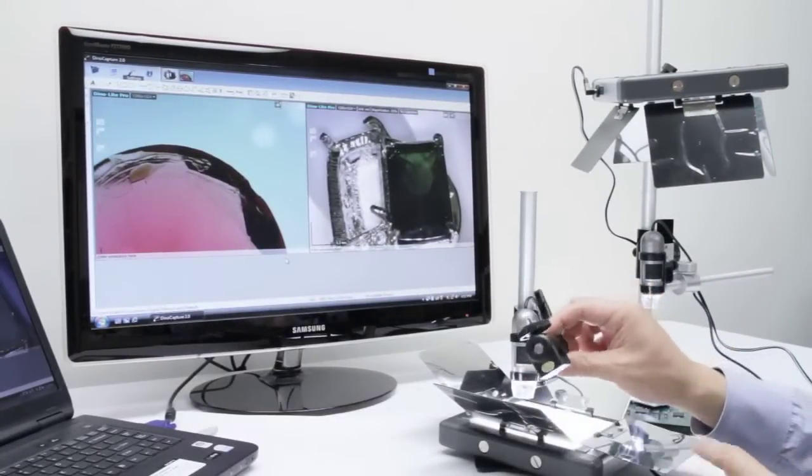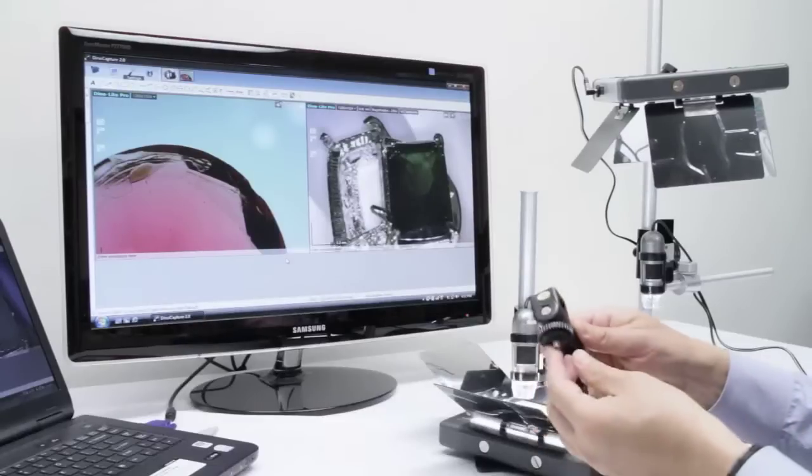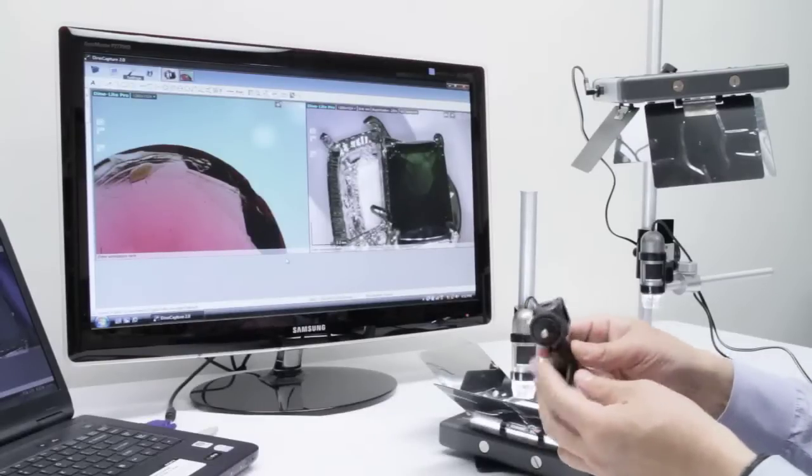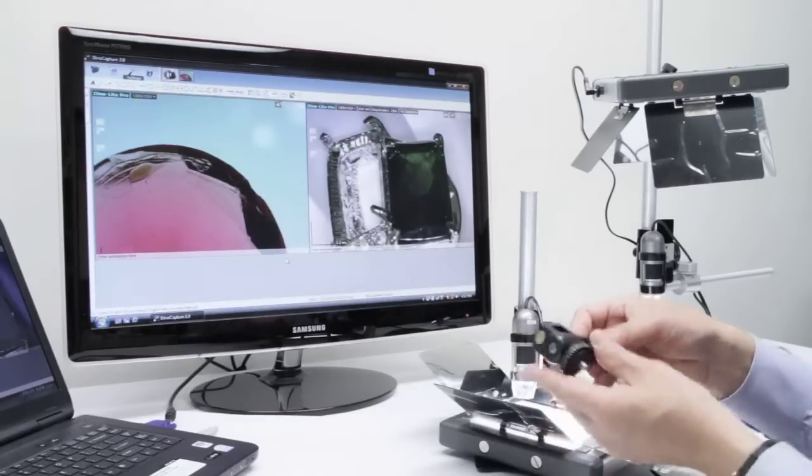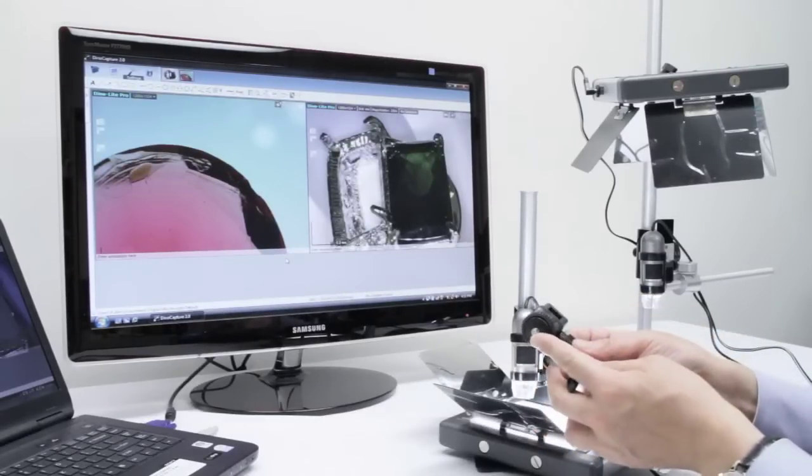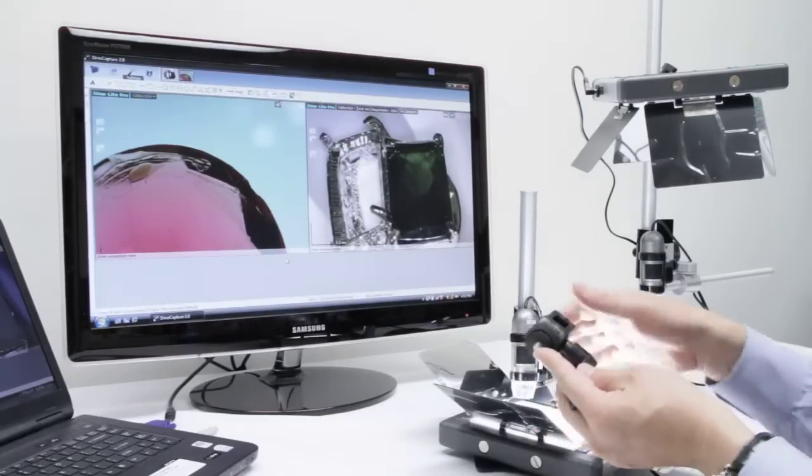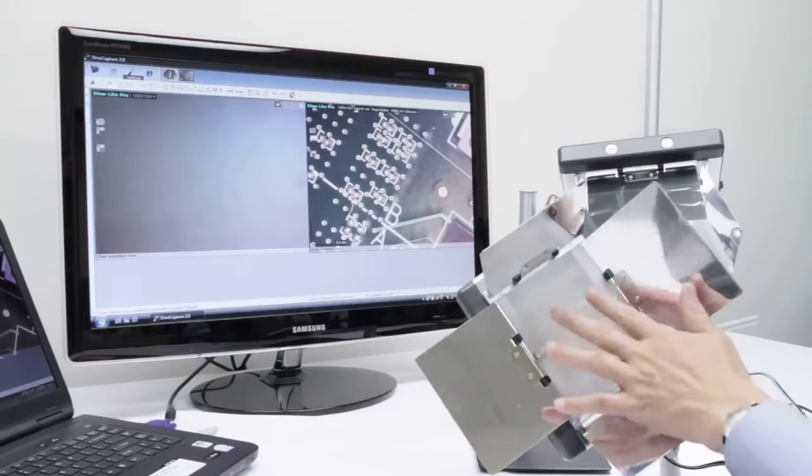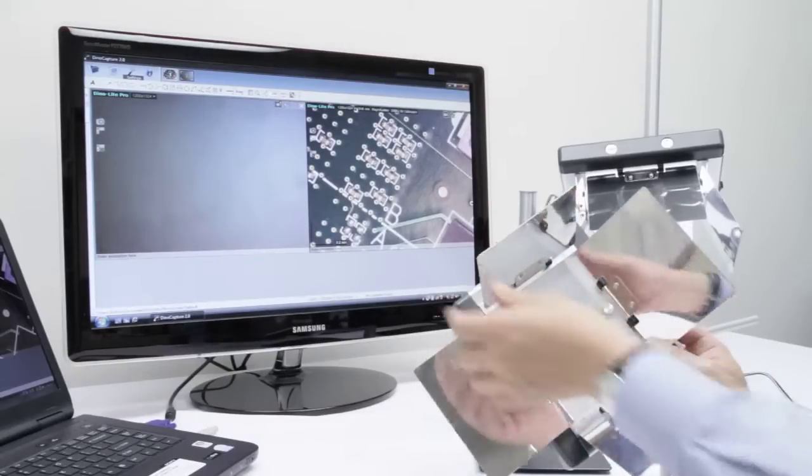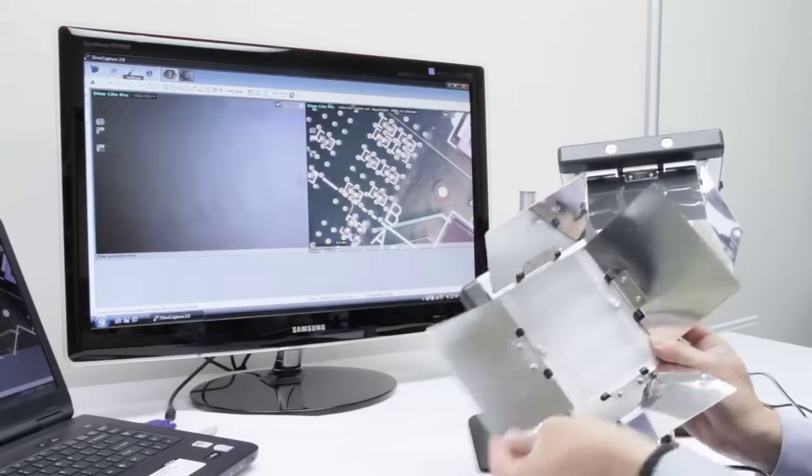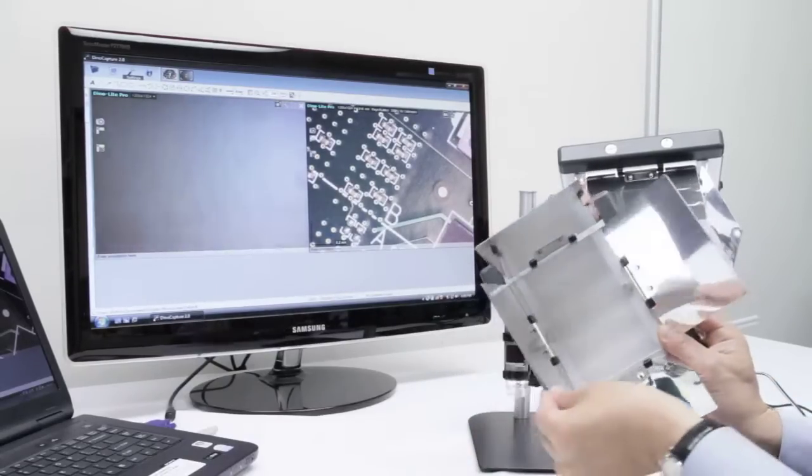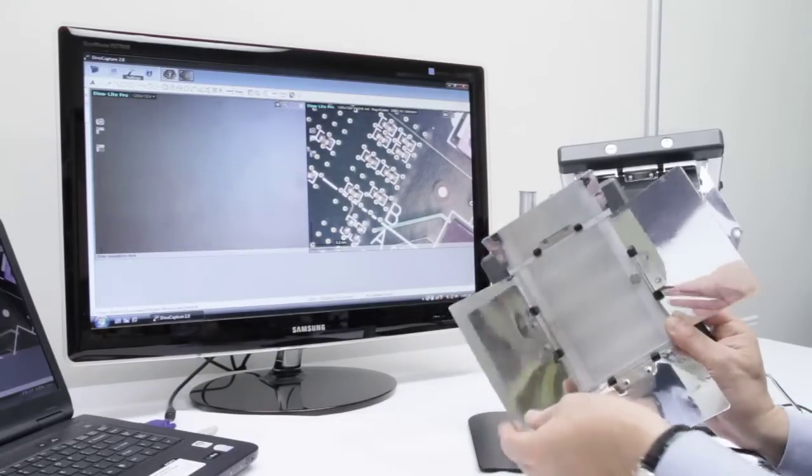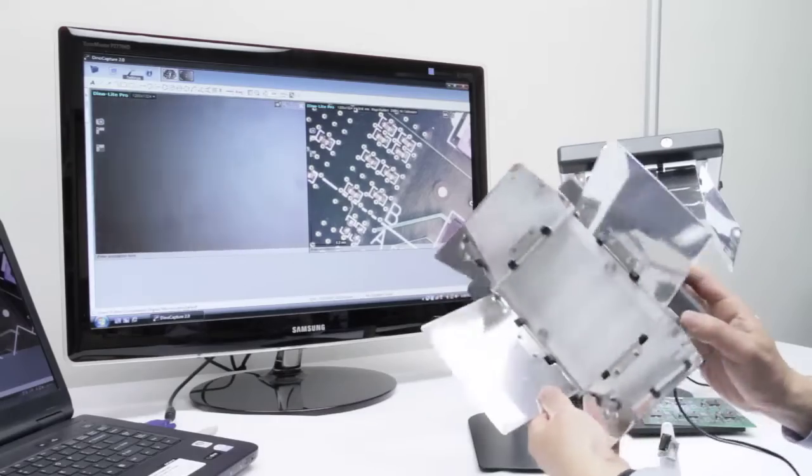This backlight also comes with a tripod adapter that you may be able to use on some light boxes. As you open the light box you will notice it has a sturdy base as well as highly reflective directional panels.